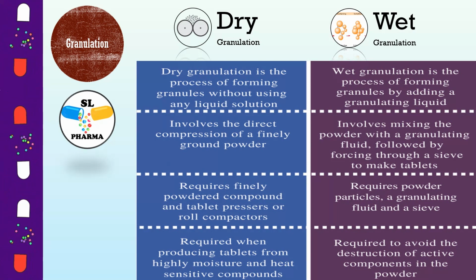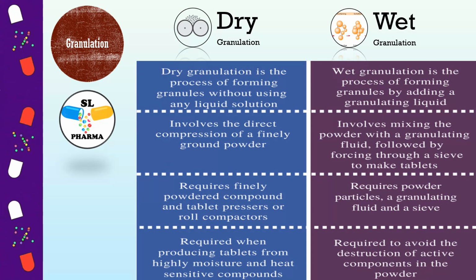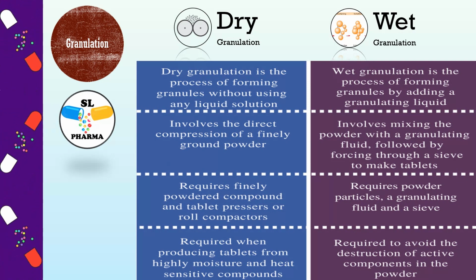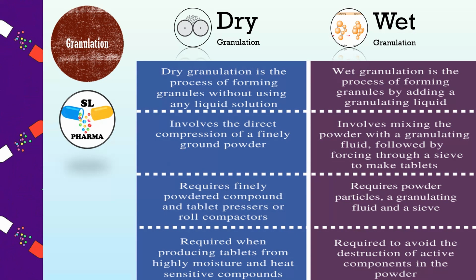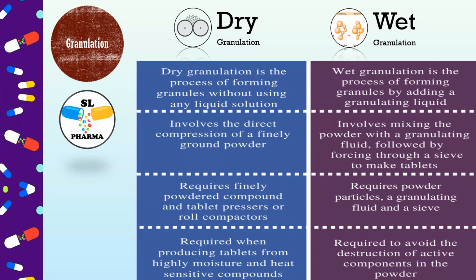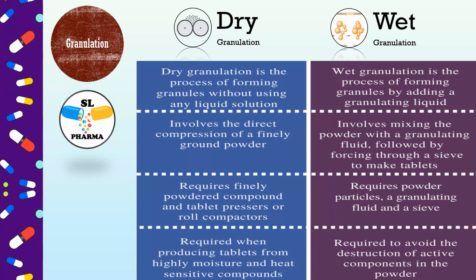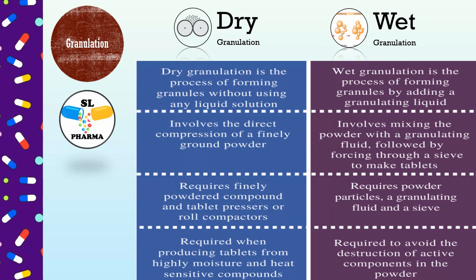For molecules sensitive to external factors like temperature and moisture, granules can be generated by the dry mixing process. Manufacturers can, if needed, select molecules with specified particle size and directly compressible grade of excipients. Wet granulation has seen many technical and technological innovations as compared to dry granulation. Molecules that need wet granulation are those not suited for the dry granulation process: high dose, poor flow, low in bulk density, without binding properties.